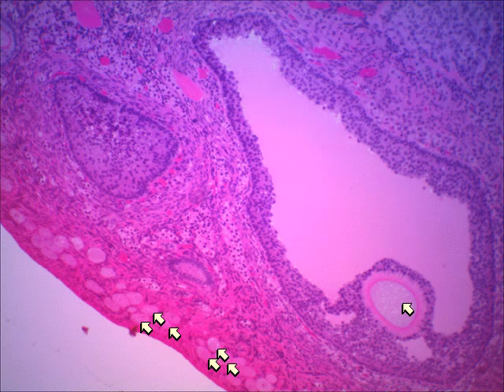Okay, so when you see this on a lab quiz or a test, or if you see one of these follicles, you'll notice that the immature egg is not right in the center of it. You'll notice that it's here towards one edge of the follicle, but that's what you need to recognize for the ovary. Okay, that's it for these slides.